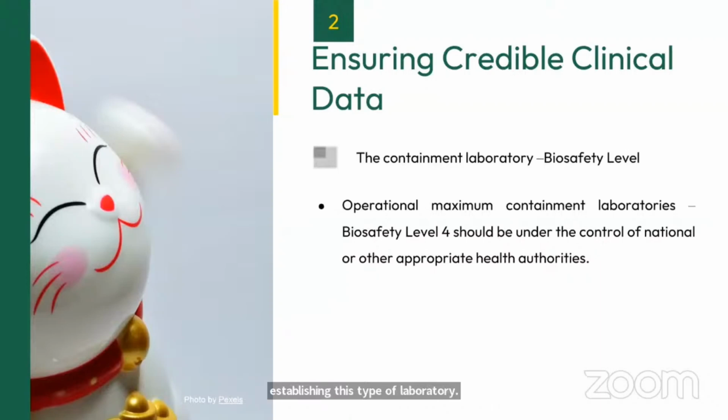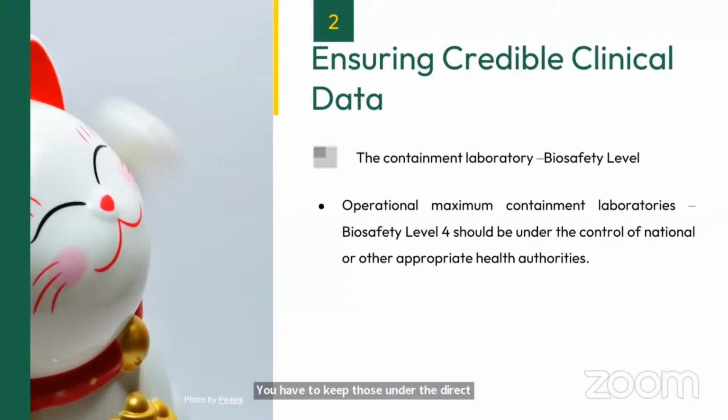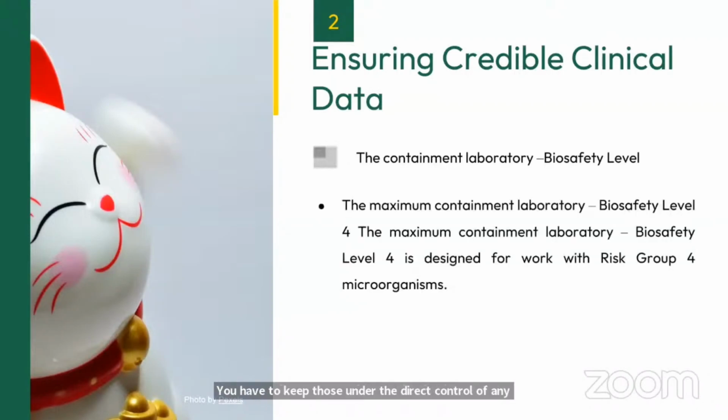Operational maximum containment laboratories should be under the control of national and other appropriate health authorities. So you have to keep those laboratories under the direct control of a national or appropriate health authority. We should take the control of level 4 biosafety laboratories.